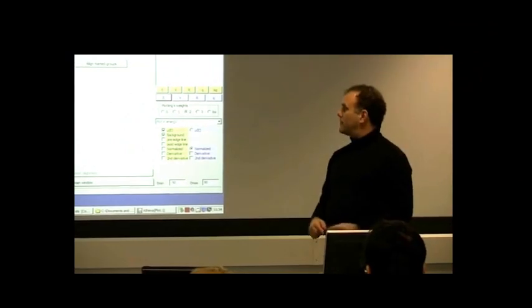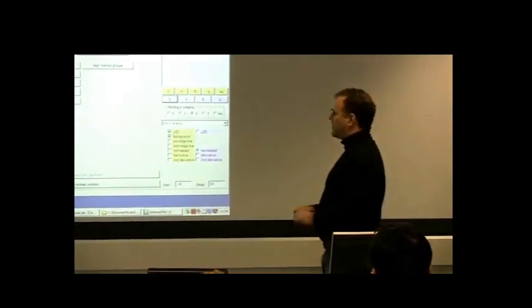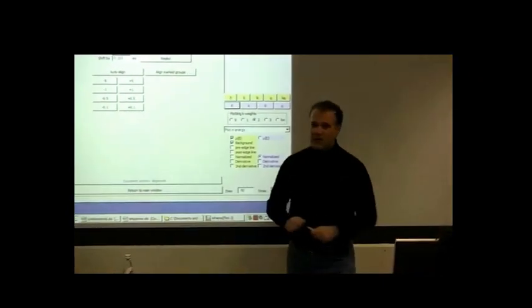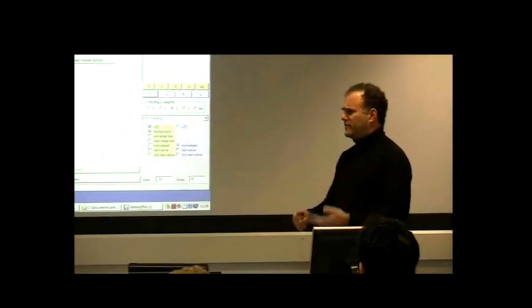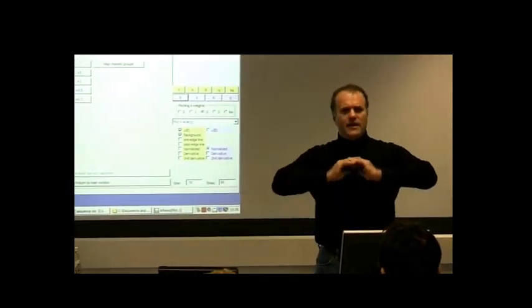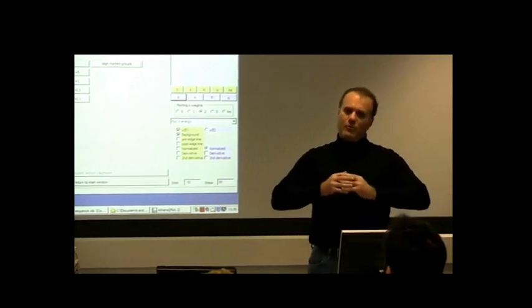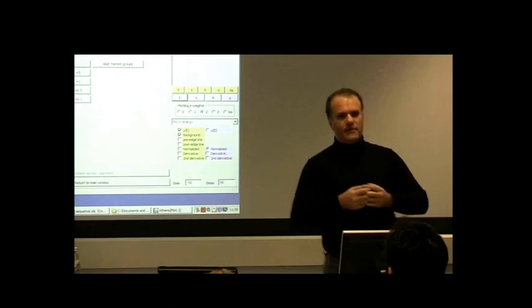Now we're about to dive into the next big thing. So at this point, I've talked about all the data processing that I have to talk about. There are probably more details and stuff will come up, but what's on the agenda now is the other program, the Artemis program, which is the thing that you use to analyze the extended EXAFS data.